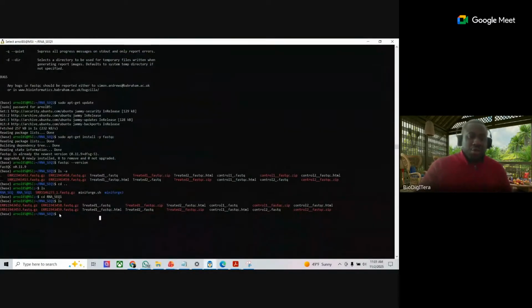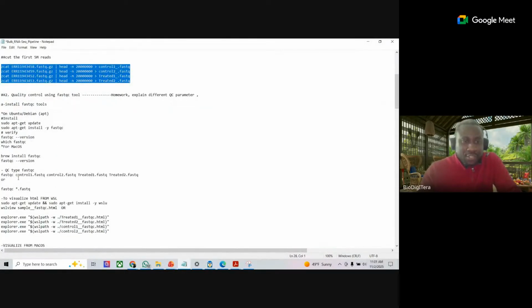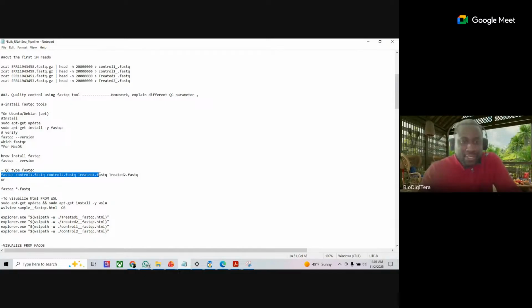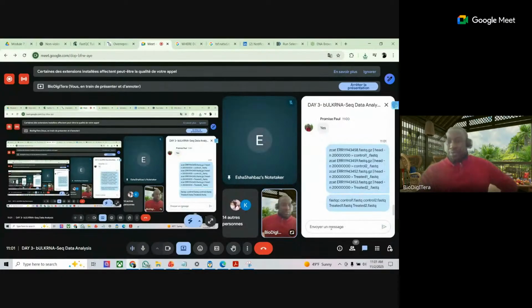Let's go now. We are going to analyze our data with FastQC. What are we going to do? Now, since you have installed FastQC, type this. I just copied it and shared it with you.